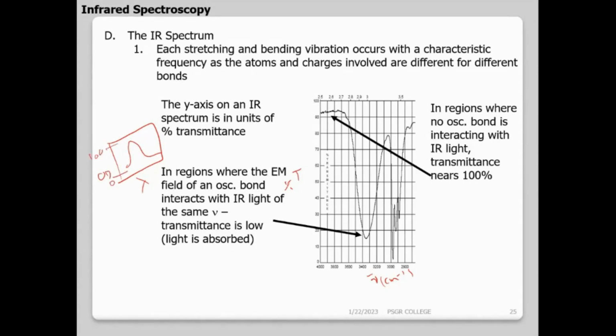But transmittance will be upside down, it is hanging. It's like a hanging garden. Okay, all the flowers, all the plants are hanging from top to bottom. So the top is 100%, the bottom is 0%. So a peak which comes from top to bottom, down to here, how much is it? Suppose I say it is 5% transmittance. What does that mean? So I have a sample.